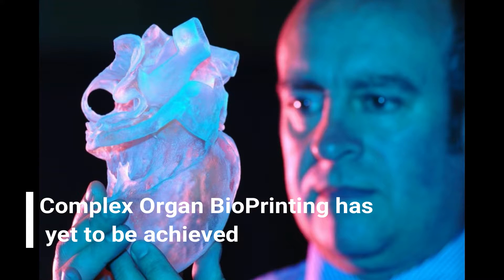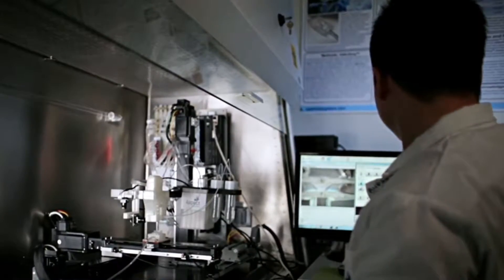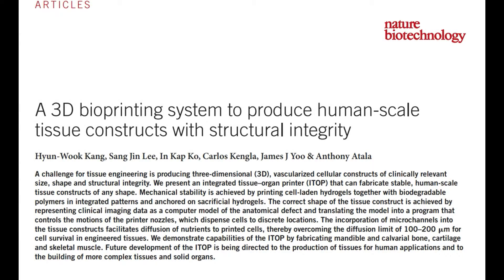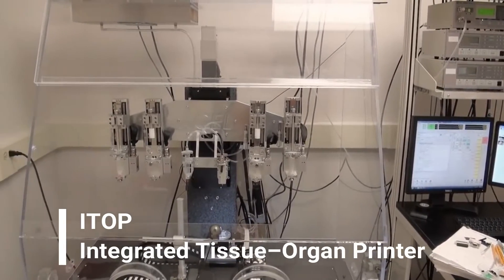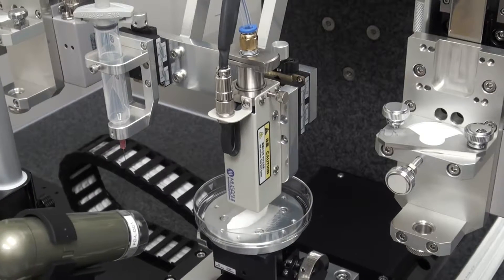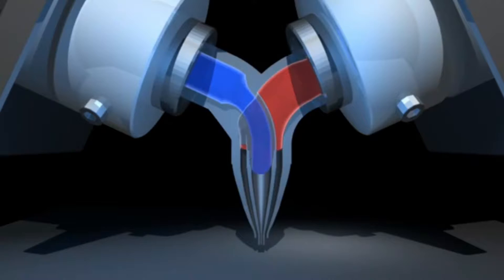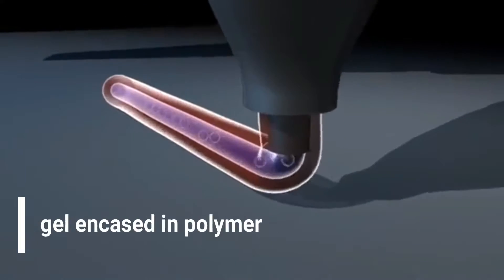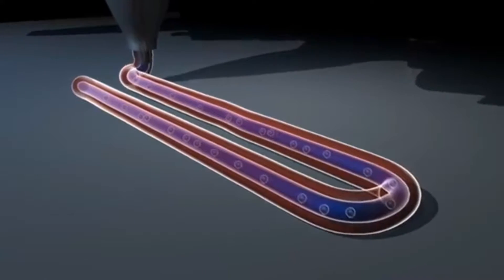Although creating complex organs such as a heart or a lung are beyond the reach of current technology, independent research groups around the world have been able to create simple constructs, such as an ear, with a commendable degree of success. Let's take a look at all the steps taken by Kang et al. to build an ear. This research group used an ITOP — meaning Integrated Tissue Organ Printer — to bioprint a human ear. ITOP is a specific class of extrusion bioprinters able to produce tissue constructs with structural integrity and complex architectures. It prints cell-embedded hydrogels in a sequence with a polymer to promote cell survival as well as growth and expansion, where the polymer serves as a scaffold providing the structural and architectural integrity that is needed.